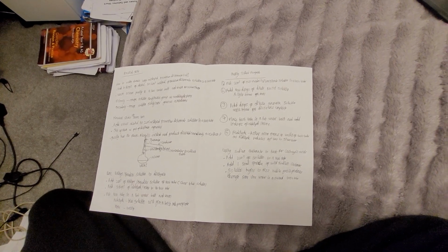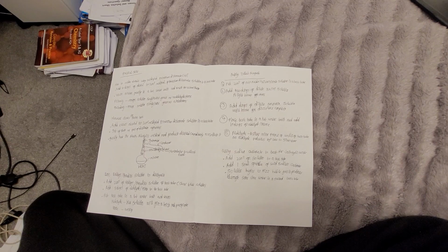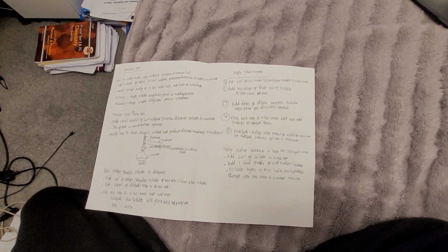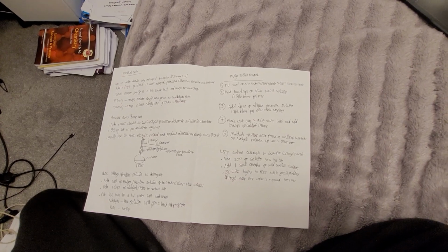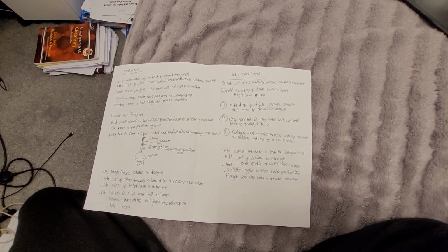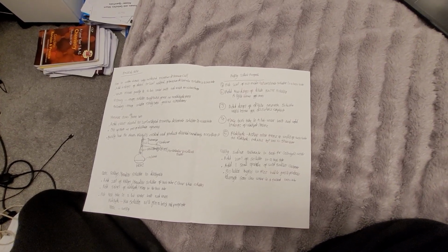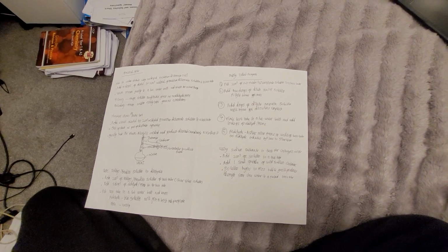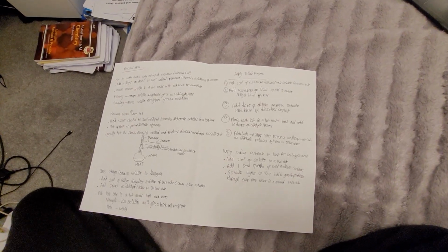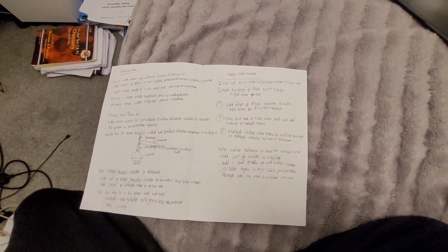Making Tollens' reagent. Put 2 cm³ of 0.10 mol dm⁻³ silver nitrate solution in a test tube. Add a few drops of dilute sodium hydroxide solution. A light brown precipitate forms. Add drops of dilute ammonia solution until the brown precipitate dissolves completely. Place the test tube in a hot water bath and add 10 drops of the aldehyde/ketone. If it's an aldehyde, a silver mirror forms on the walls of the test tube as the aldehyde reduces Ag⁺ ions to silver atoms. As for a ketone, nothing happens.